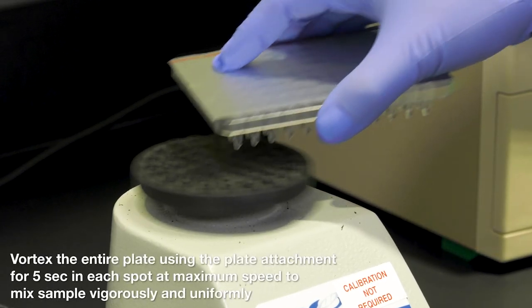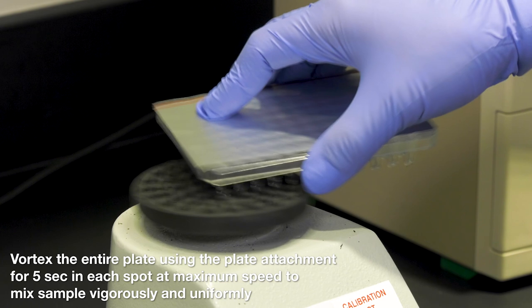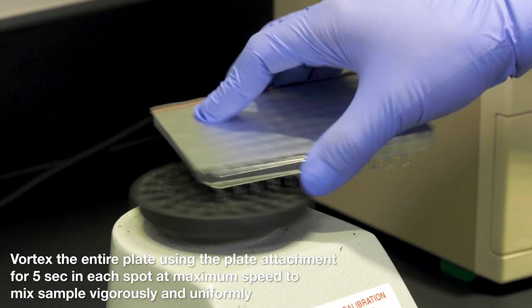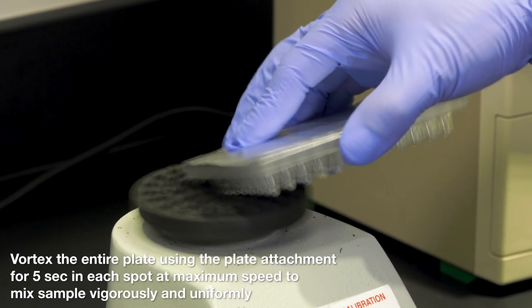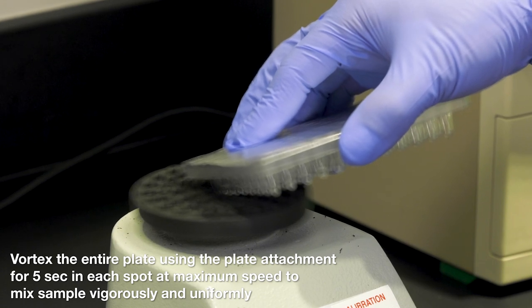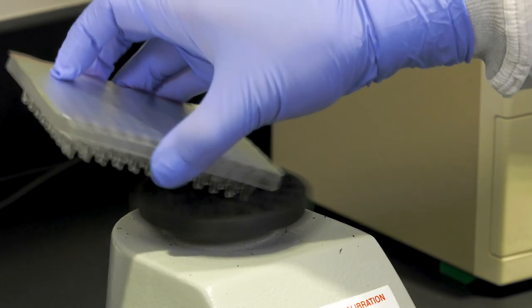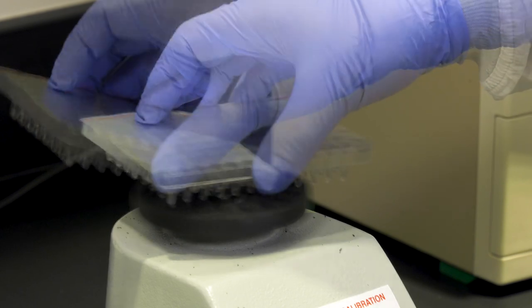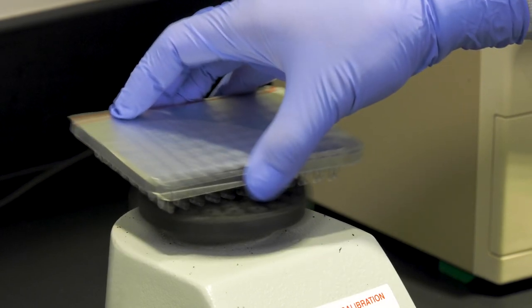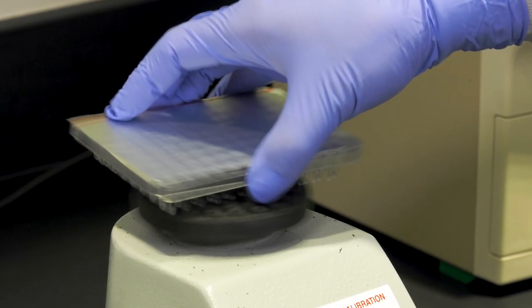Alternatively, some vortexers may have a plate attachment. You can vortex the entire plate using this. Again, you want to vortex the corners and middle of the plate for 5 seconds at each spot at maximum speed. The DD-PCR super mixes are very viscous, so you want to make sure to mix the plate really well.